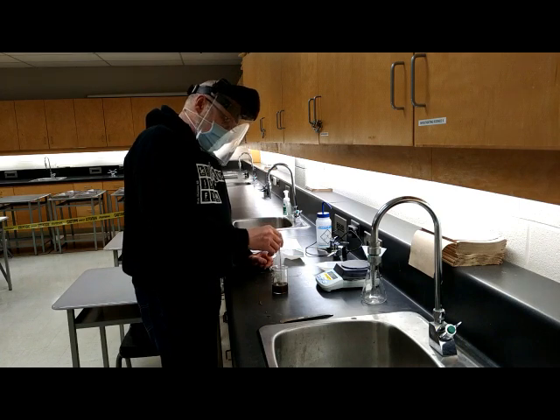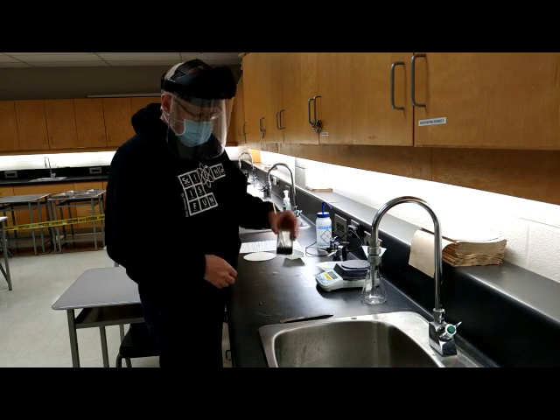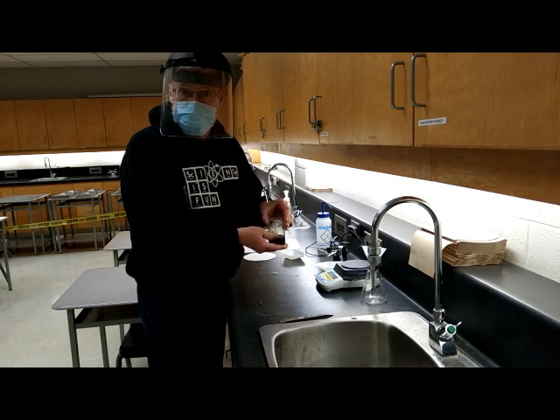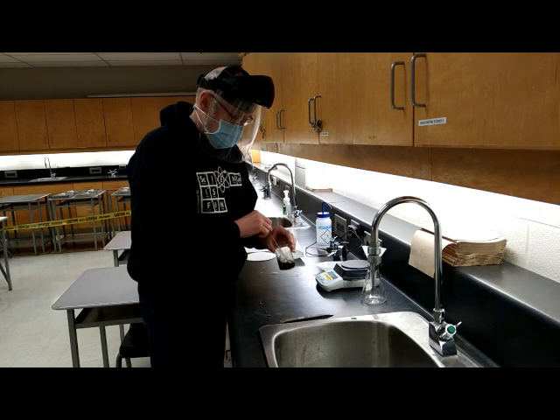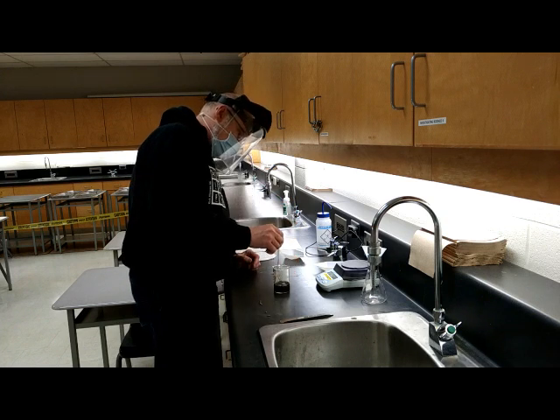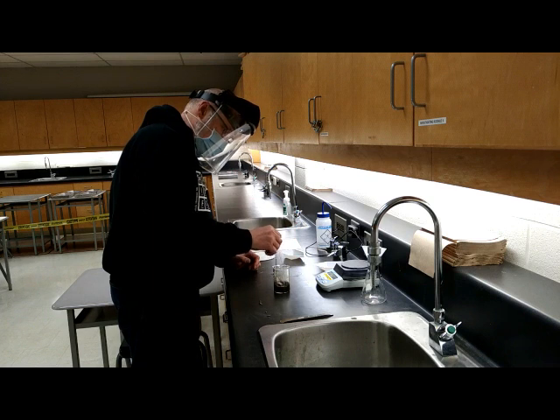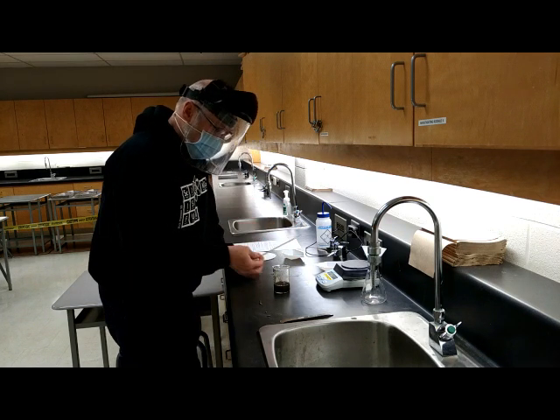Doesn't take very long. Now, a couple of things that you might have noticed. Sir, the beaker's warm. Is it supposed to do that? Yeah, it's supposed to do that. And as you see the reaction progressing, I'm just going to let that sit now and settle out.